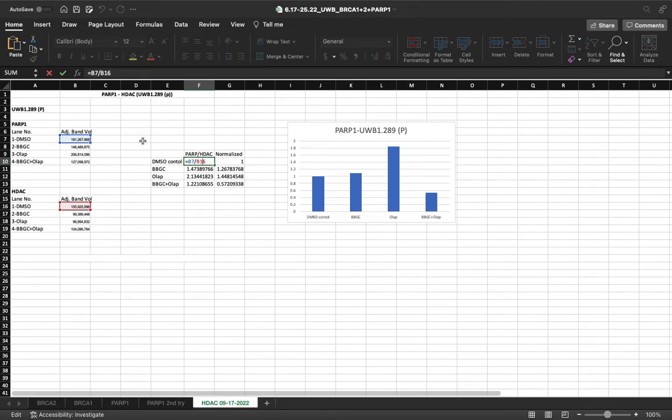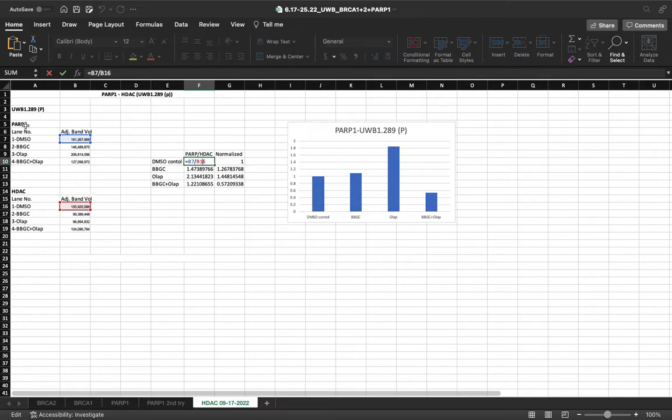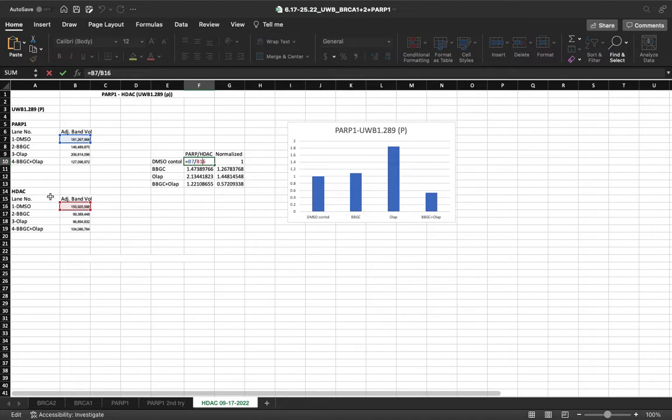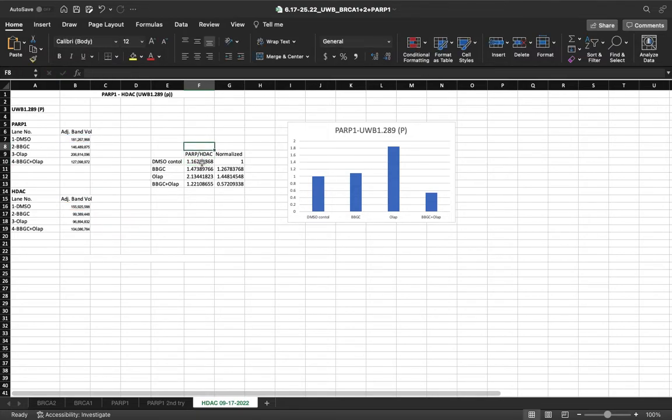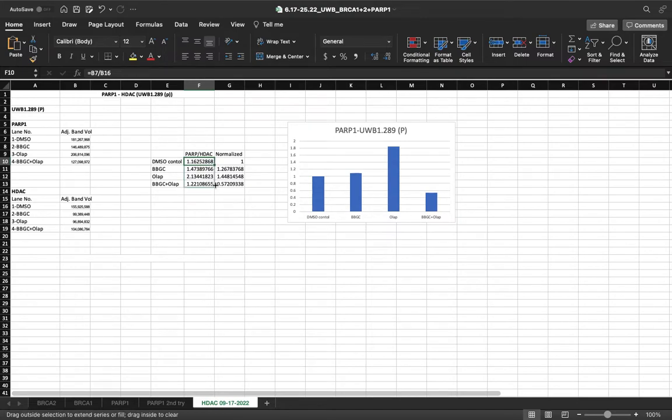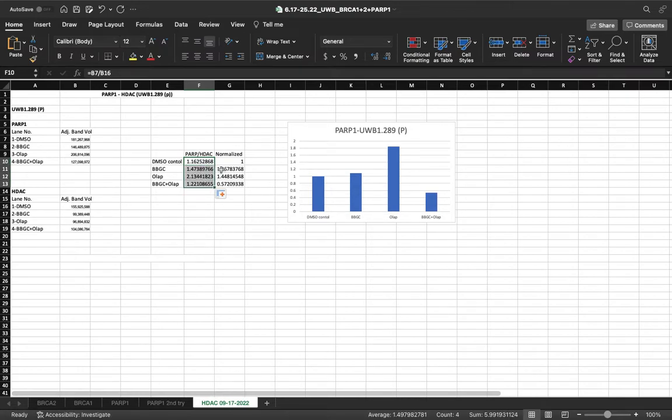Here's an example. All you have to do is take the adjusted band volume of the experimental protein and divide it by the loading control. So this is B7 divided by B16. Once you've done it once, you can take that formula and just drag it down from the green square. So, it's already been done.